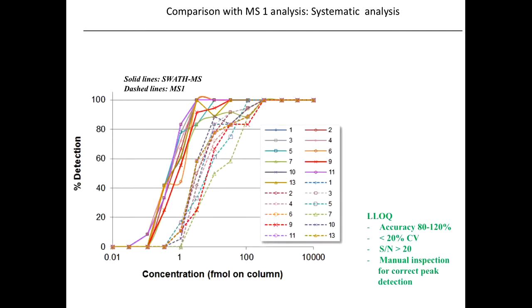So we believe, and this was then borne out by some broader analysis across the various sites, these are the 11 sites, that if we quantify these isotopic label peptides across their dilution series, from exactly the same data acquired in the same instrument at the same site, by MS2, by the SWATH analysis, or by MS1, there is about an order of magnitude difference in limit of detection.